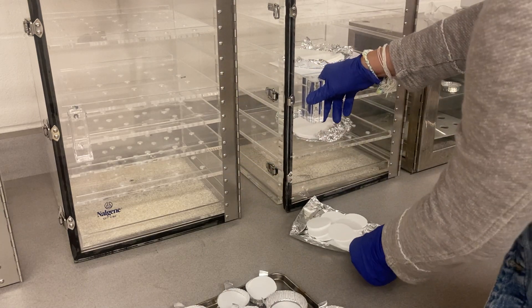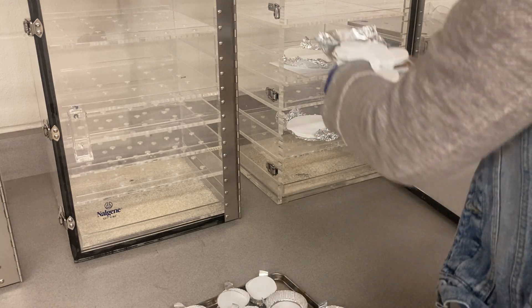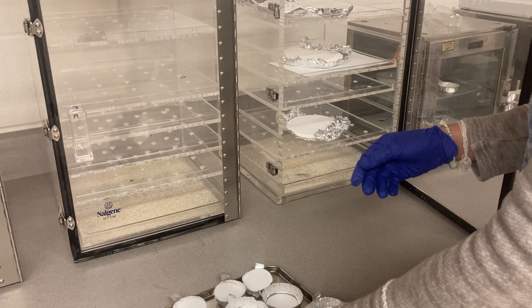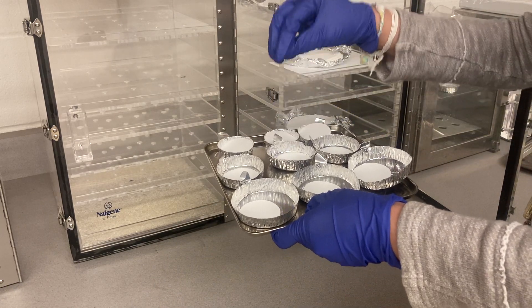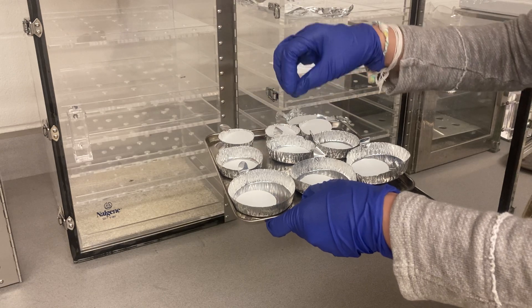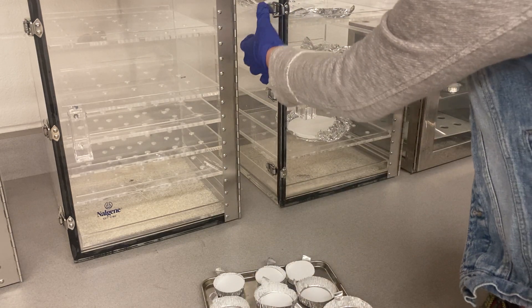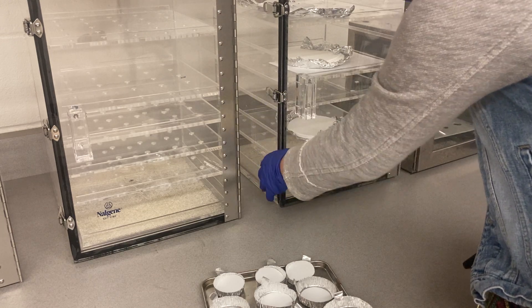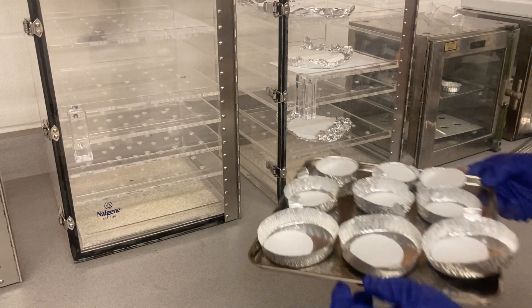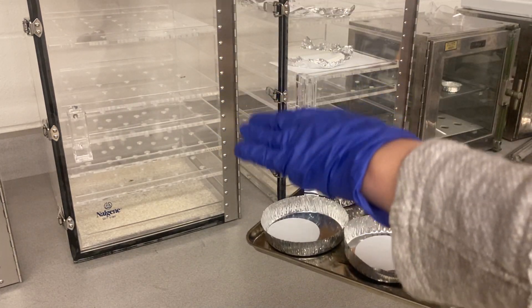We have to let everything cool down before we weigh. If we weigh something when it's still hot, the temperature of the air will cause it to expand. You will have less air pressure, and when you have less air pressure you're going to get a weight that is less than usual, because the air that's supposed to press on top of the sample becomes less.